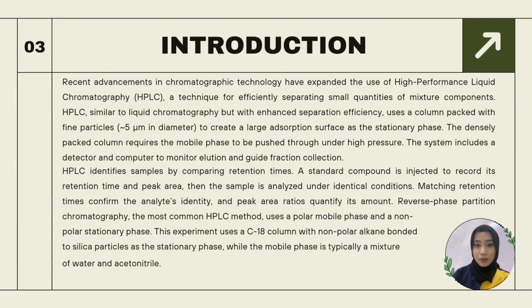It uses a column packed with fine particles, 5 micrometers in diameter, to create a large adsorption surface as the stationary phase. The densely packed column requires the mobile phase to be pushed through under high pressure. The system includes a detector and computer to monitor elution and guide fraction collection.